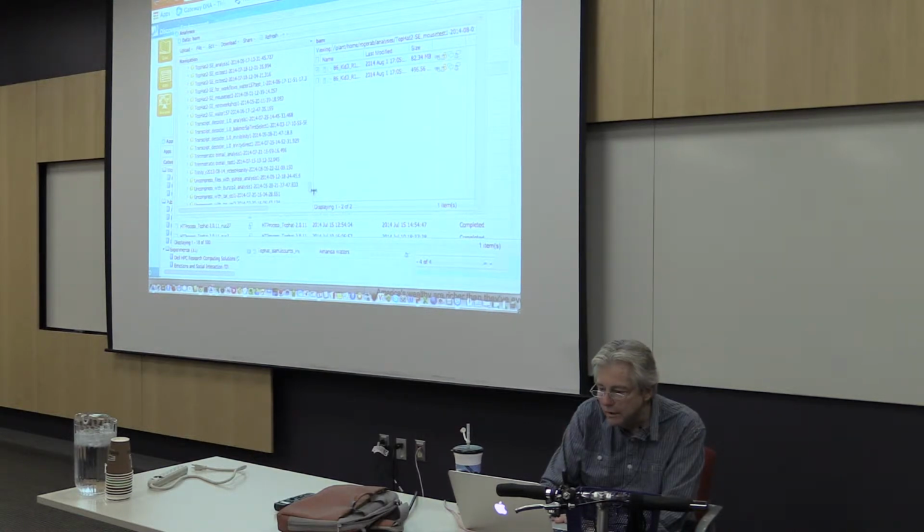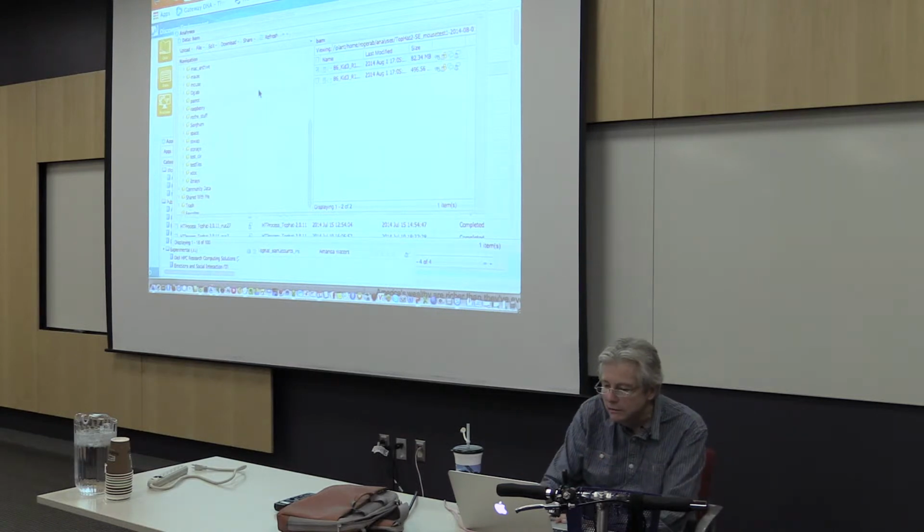Because I like to look at my files all the time. I don't like to depend just on faith that stuff is going on in there.